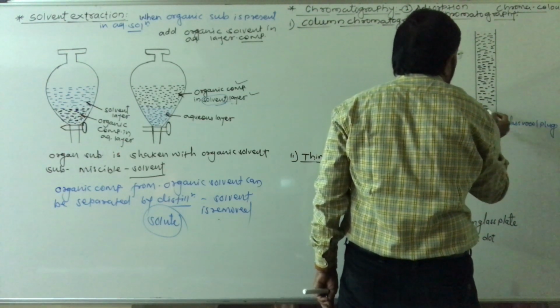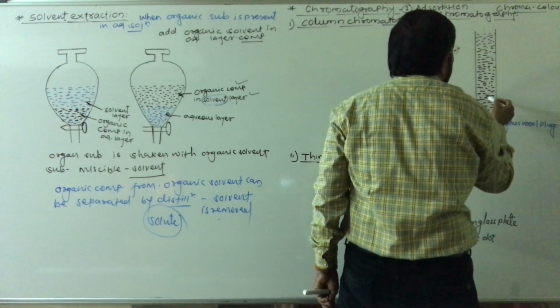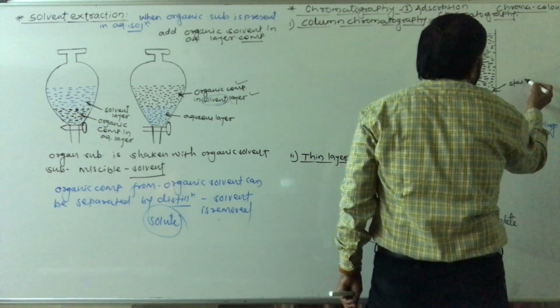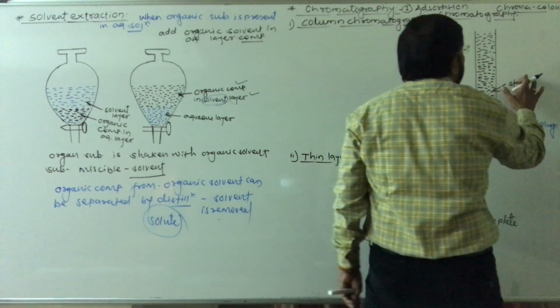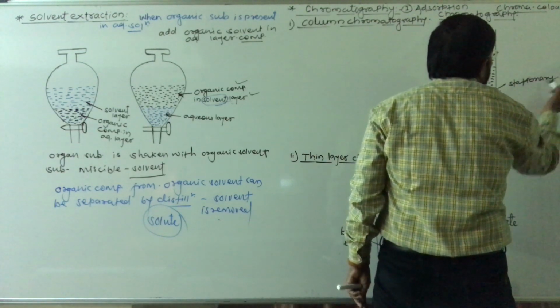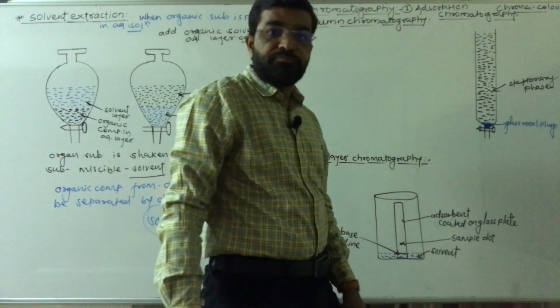It is manufactured by filling silica gel or alumina gel in it. This is the stationary phase, it is the adsorbent.